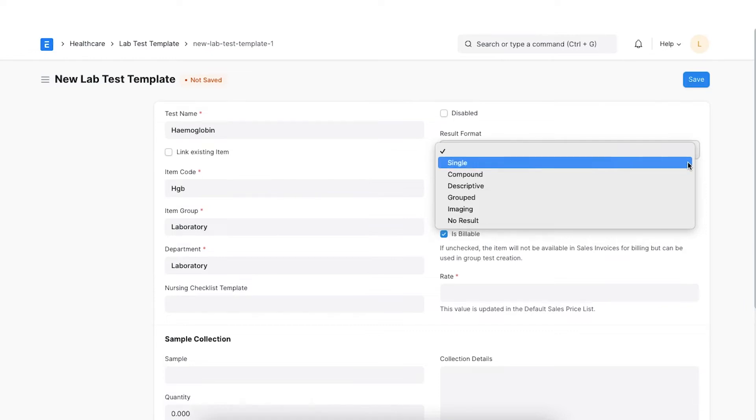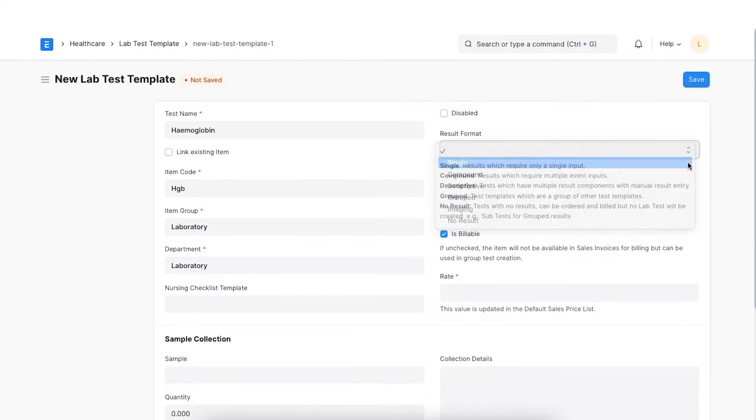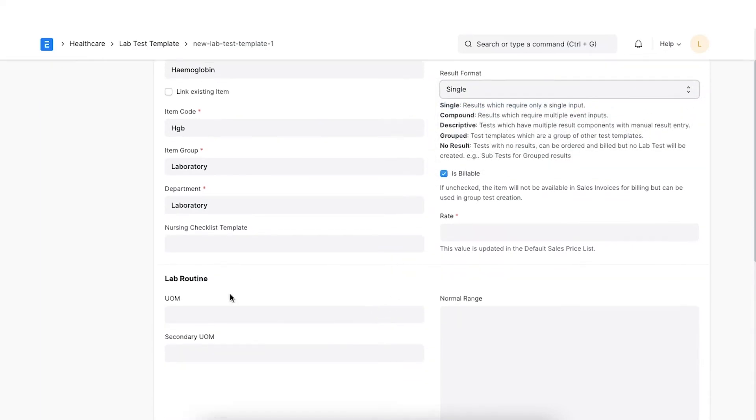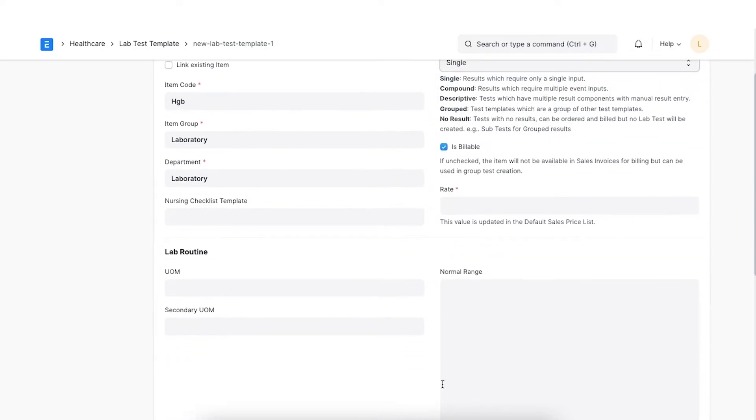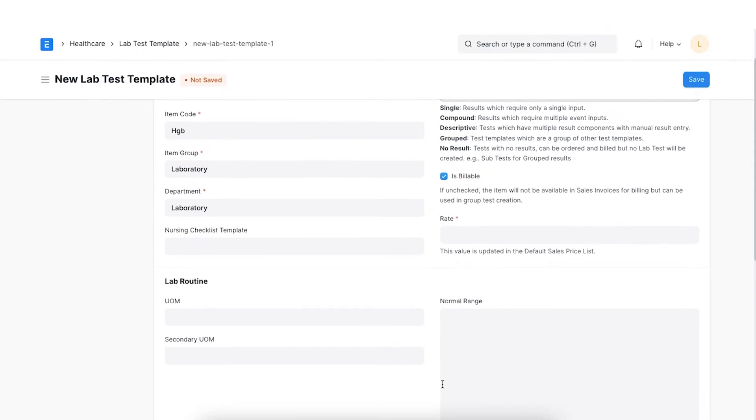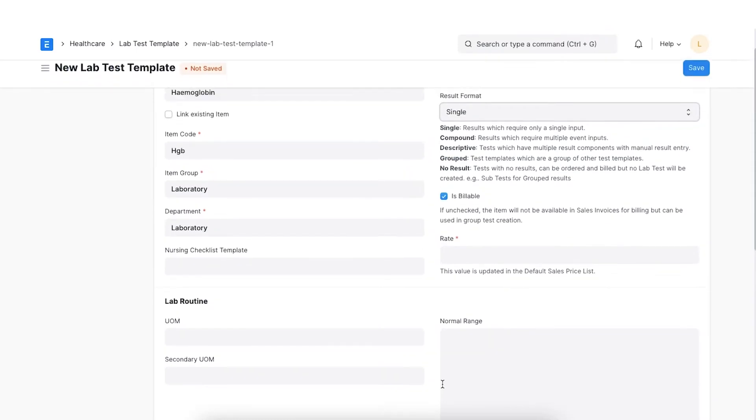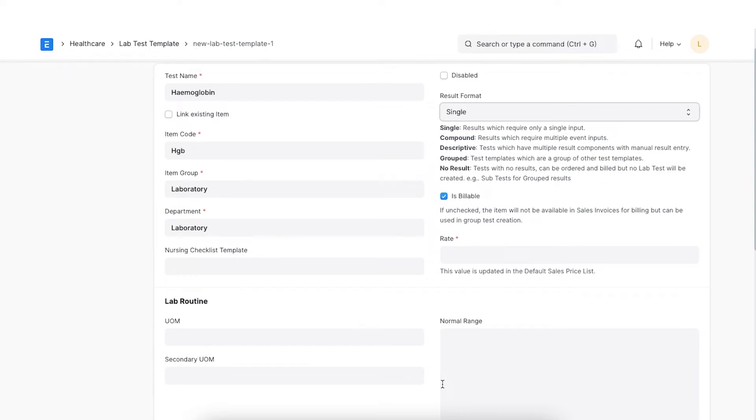Single. In this type of lab test, only one result value is interpreted. After filling up the details specified in the first step, the UOM, the secondary UOM and normal range needs to be set. For example, the hemoglobin test is often used to check for anemia, usually along with a hematocrit or as part of a complete blood count, i.e. CBC.